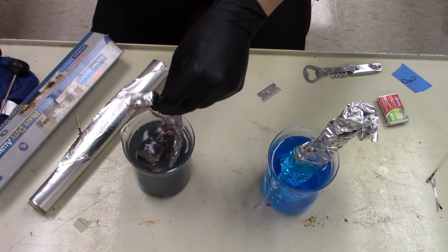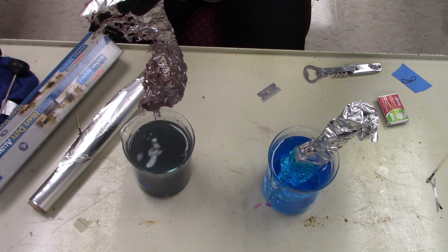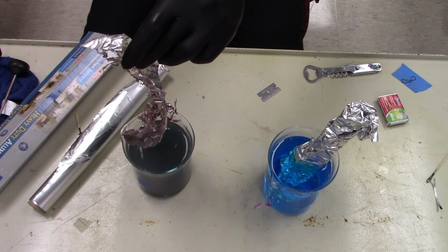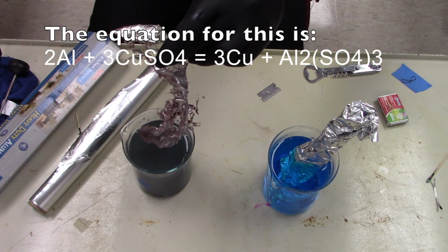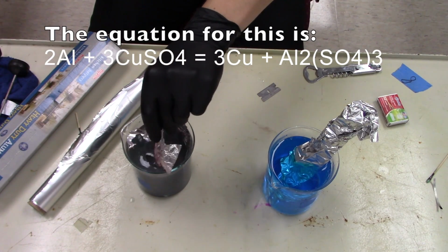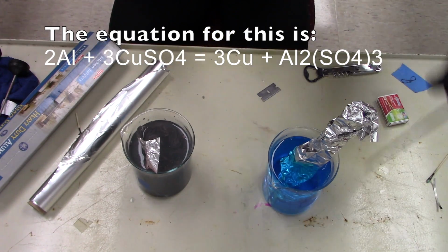So if you look, it's being chewed away. Now do you see the patina that's on there? That's copper. So what's happening is the aluminum is trading places. The aluminum's going from solid mass to dissolved in the water, and the copper is going from dissolved to solid mass collecting here. Now, if we leave this sit here, it'll do that because, I mean, that's what it's doing.